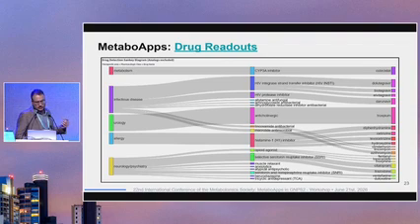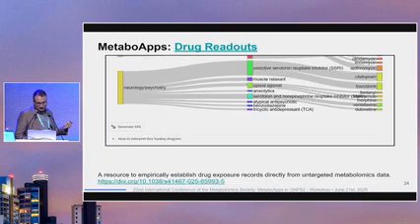And on this one, you can also check the different types of classes, as I mentioned before, if it's already known to be a food metabolite, an endogenous, a cosmetic, a personal hygiene product, and things like that. We already have that information for the drugs that are present in the library.